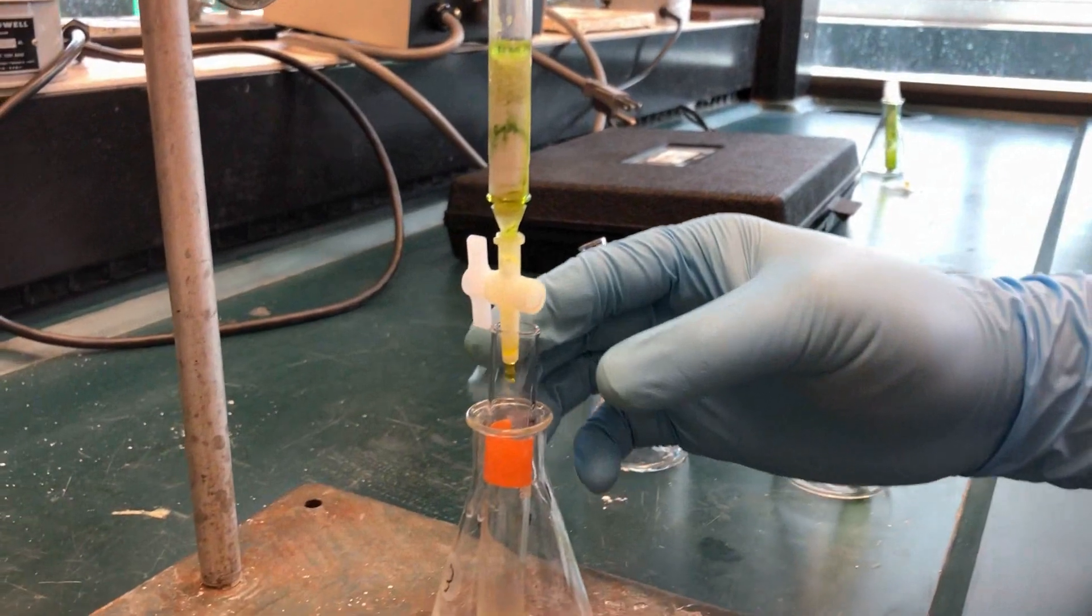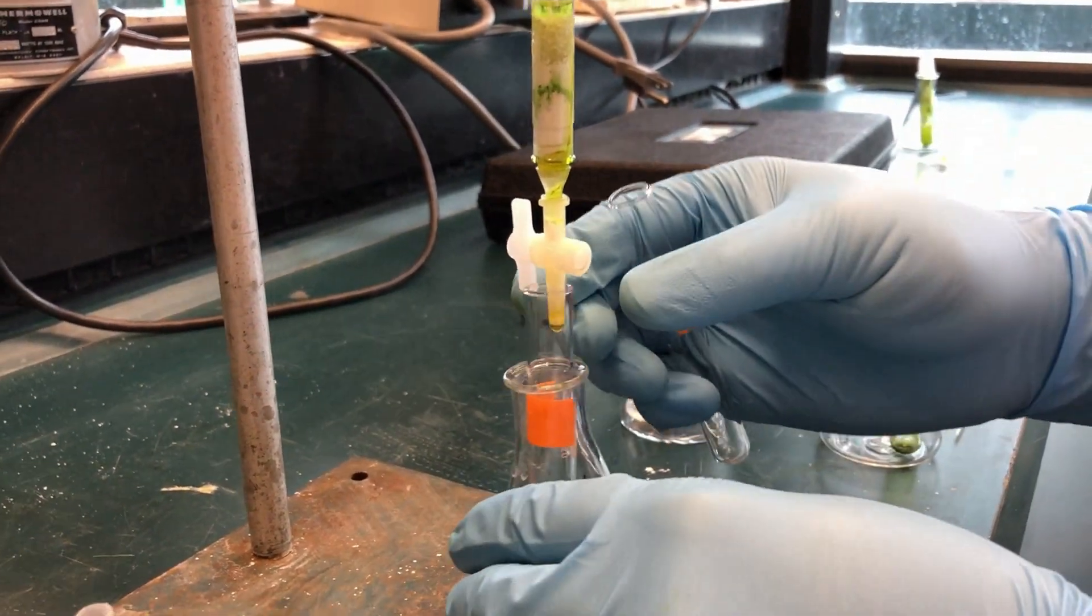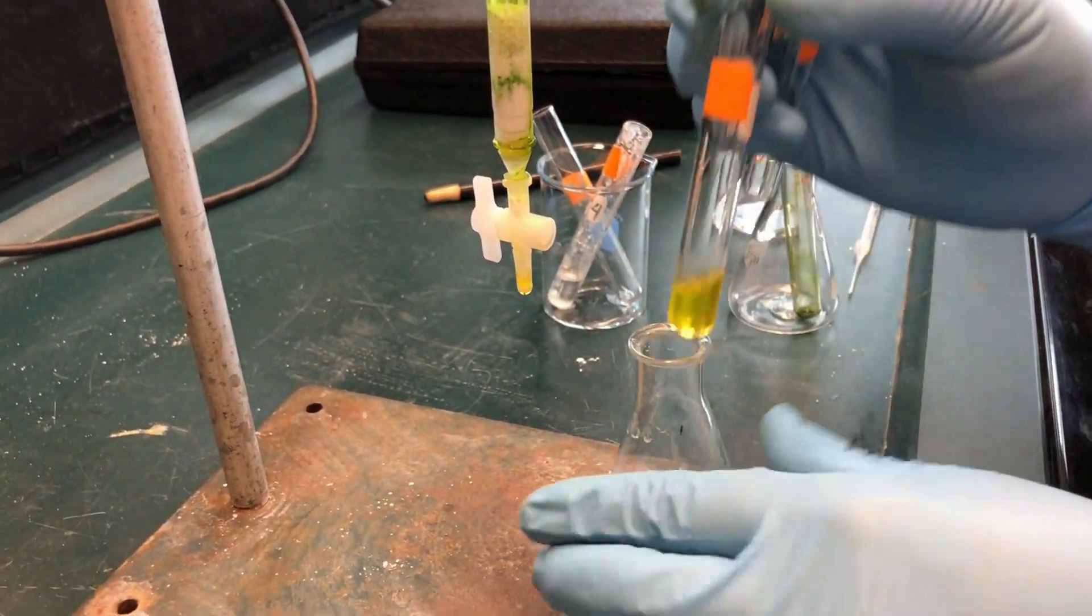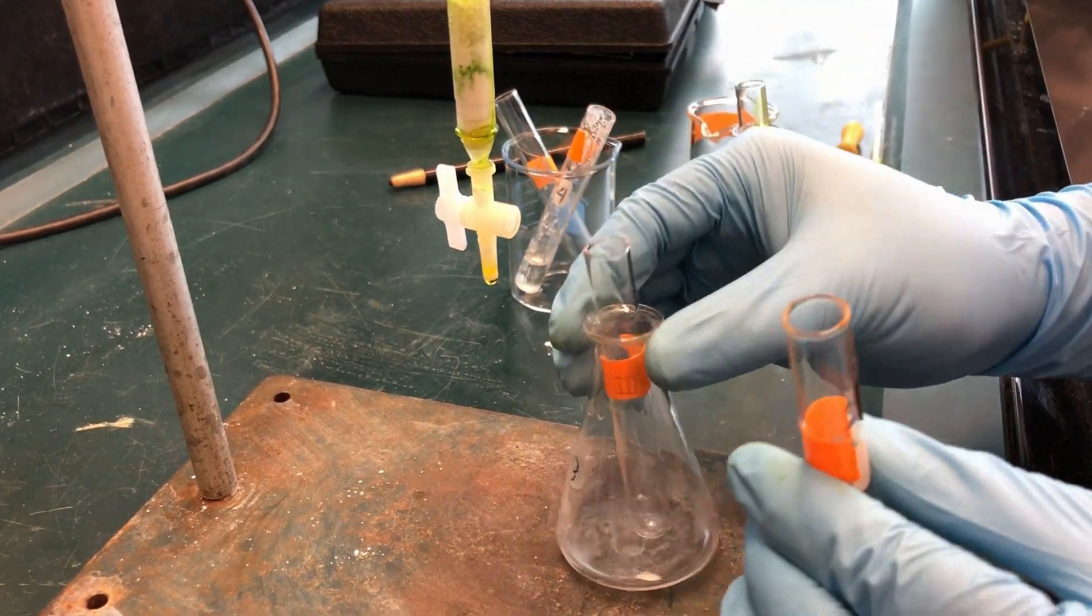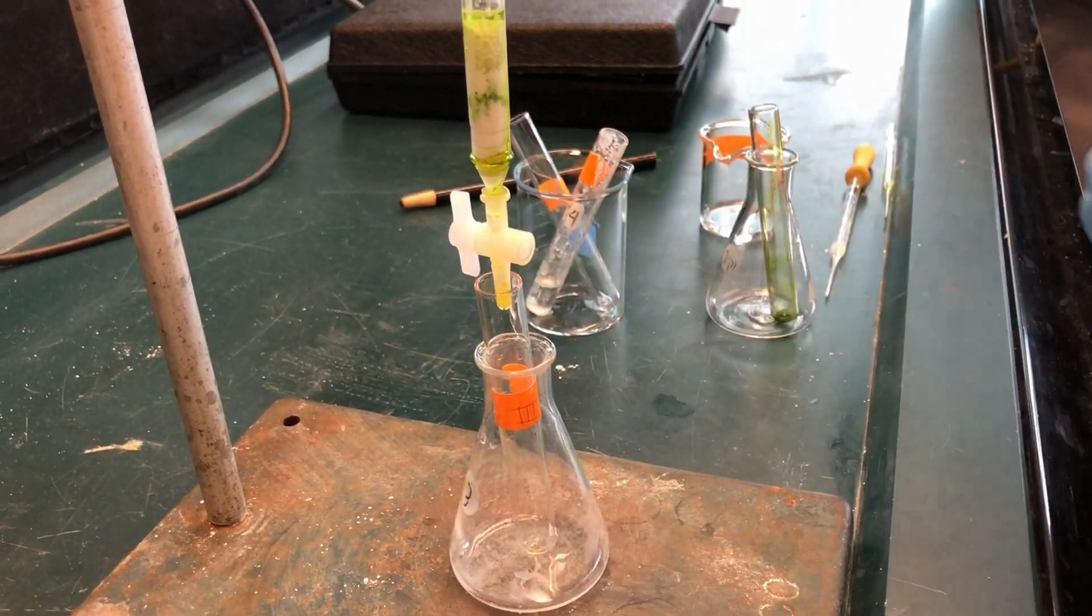After you have collected the yellow pigment, switch to test tube 3 to collect the intermediate between the green and yellow pigment until you can see the green band moving down the column.